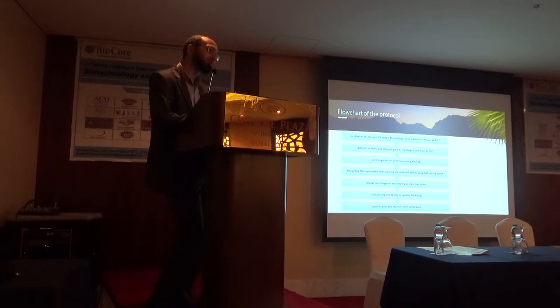The other protocols or other ways for preparing bacterial ghost usually obtain about 90, 95, 99% killing of the population, which is a bit dangerous when we are using it as a vaccine. We have some live organisms. So it's very important to kill 100% of the population. So in order to confirm the safety of the product, we have to subculture in order to confirm the full killing. After that, lyophilization and store at room temperature.